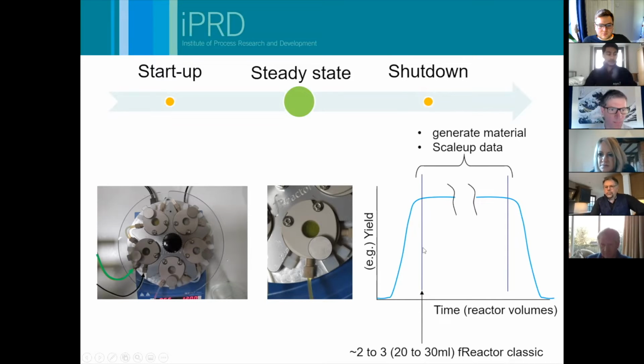Okay, so that's typically what we see within a flow chemistry situation, as opposed to a batch chemistry situation where we might bring our materials together and we don't continue to add. In some cases you can, but generally we bring our materials together at the start of the reaction, we stir them, and they change continuously with time until the end of the reaction's reached. So that's one of the differences between flow and batch chemistry.